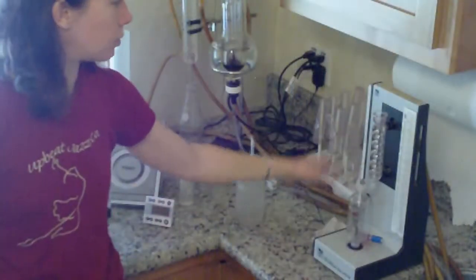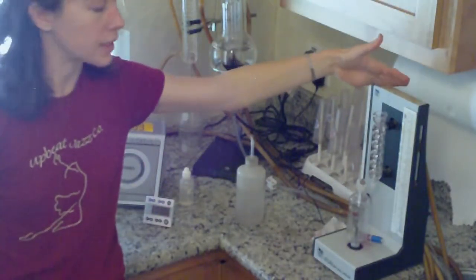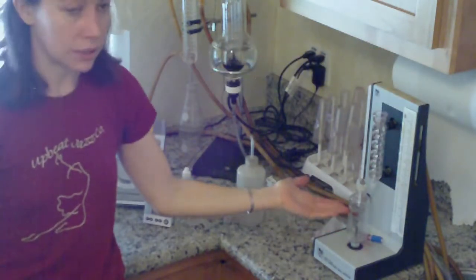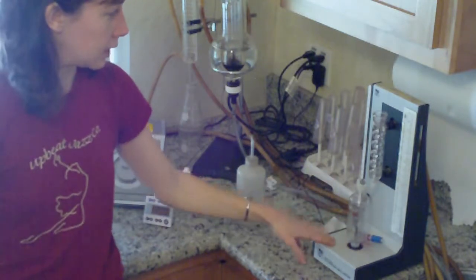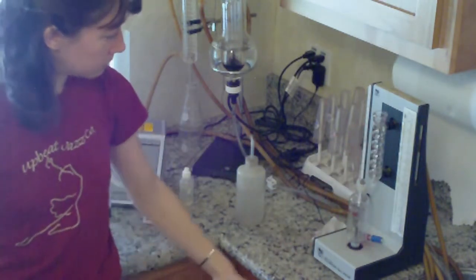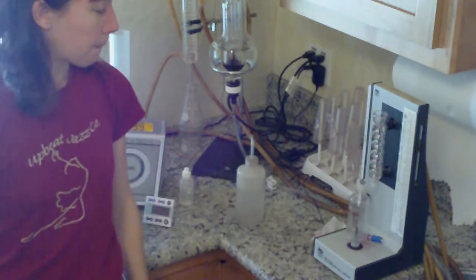So this is our ebulliometer or in layman's terms, this measures alcohol content. And this one's really easy. You just fill up a wine sample up to this one line, and you have to make sure to calibrate with boiling distilled water before you add the wine sample, which should have zero alcohol.